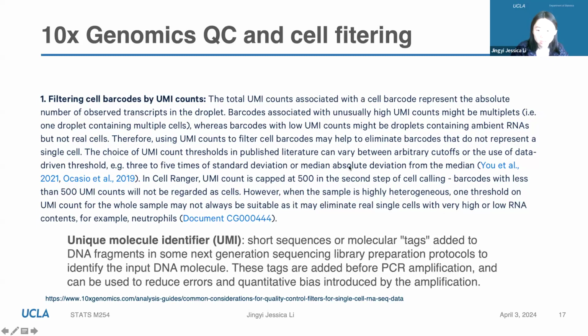In these two papers, you can check from the 10x website. The link is here, it's the URL. They use 3 to 5 times the standard deviation or median absolute deviation from the median. So what does it mean? There is twofold information.